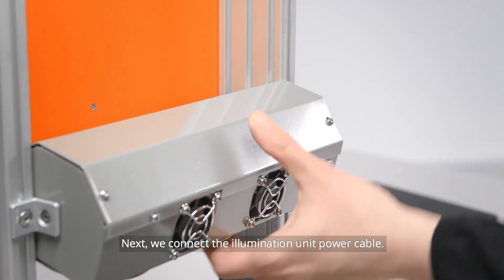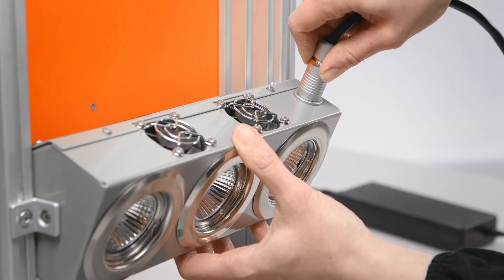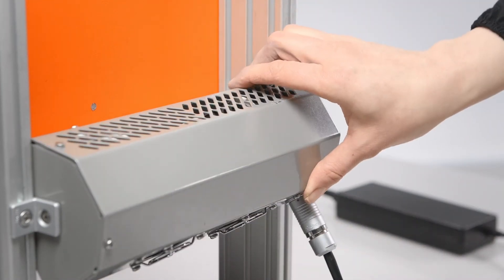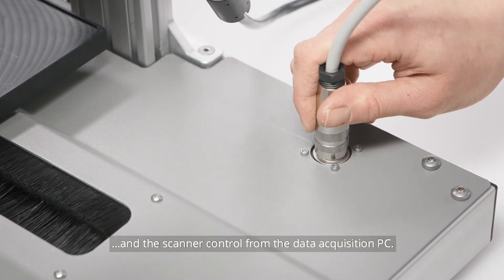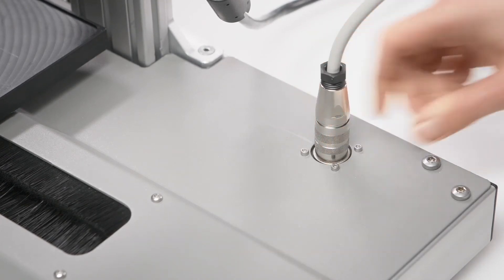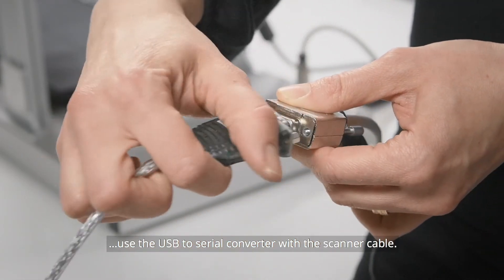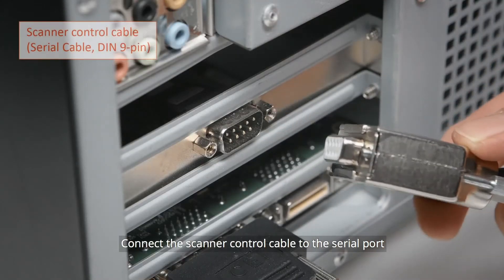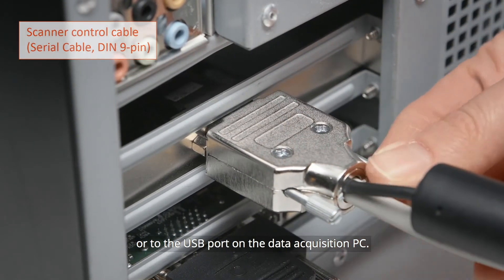Next, we connect the illumination unit power cable and the scanner cable, which provides both power to the scanner and scanner control from the Data Acquisition PC through serial communication. If you connect the scanner to the USB port of the Data Acquisition PC, use a USB to serial converter with the scanner cable. Connect the scanner control cable to the serial port or to the USB port on the Data Acquisition PC.